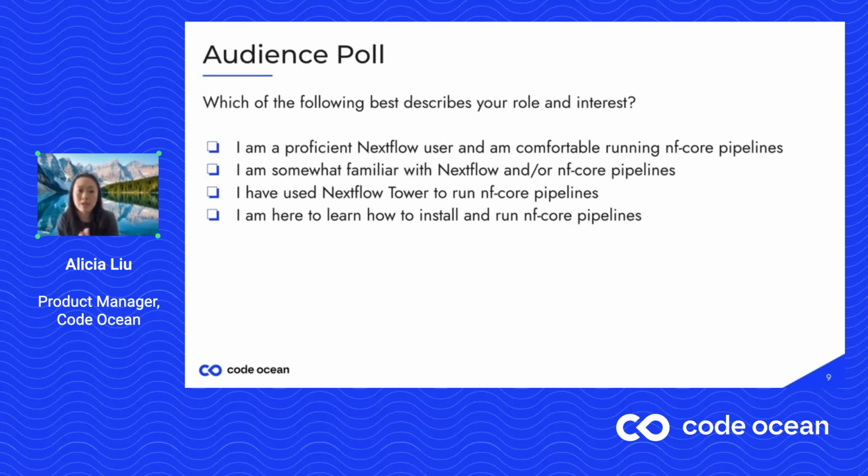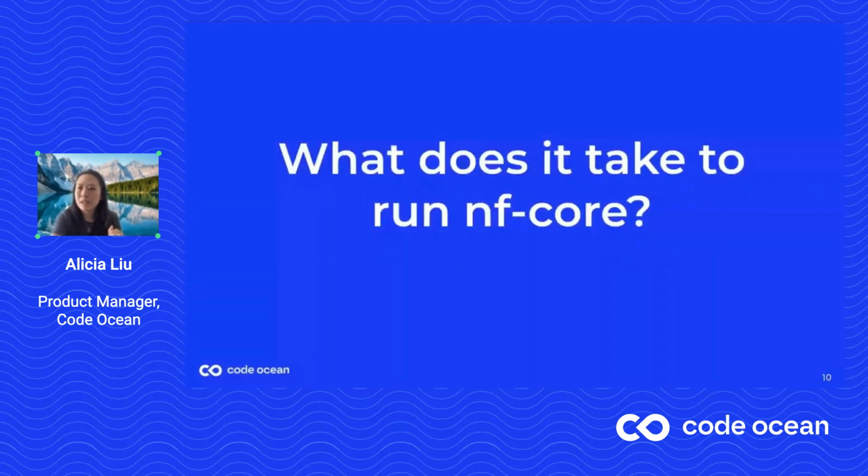These results are really interesting to see, and I hope those of you who are here to learn how to install and run these pipelines are going to find the session really helpful. So let's go ahead and move on. We've talked a lot about NF Core and how great their pipelines are.